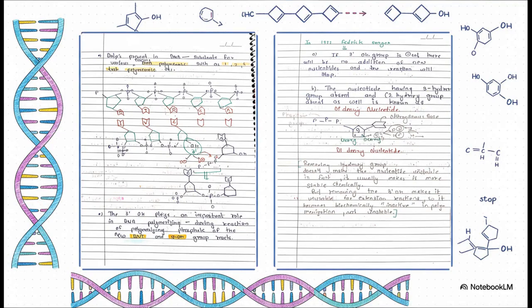This slide shows the trick perfectly. On the left, you've got a normal, everyday nucleotide with its little OH group hook all ready to connect. Now, look to the right. That's Sanger's secret weapon, a dideoxynucleotide. See that same spot on the sugar? The hook is gone. It's been replaced by just a hydrogen atom. It's such a tiny change, but it has enormous consequences.